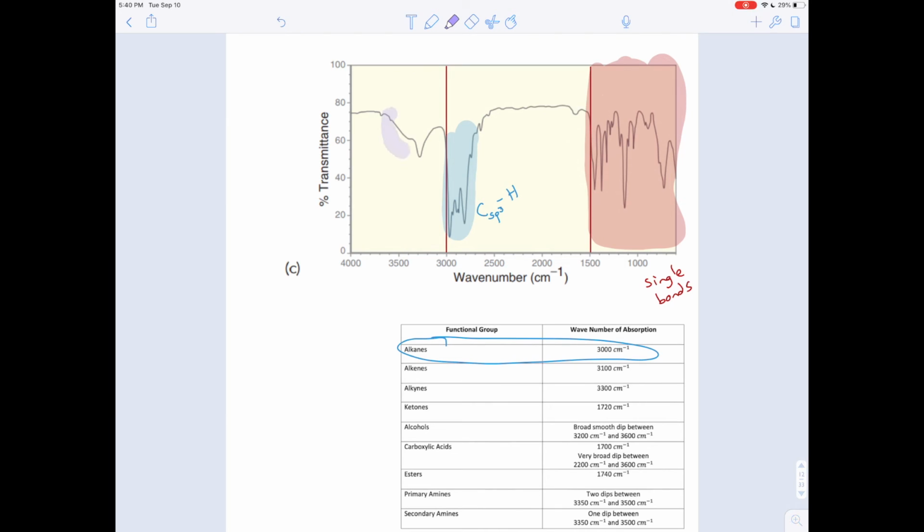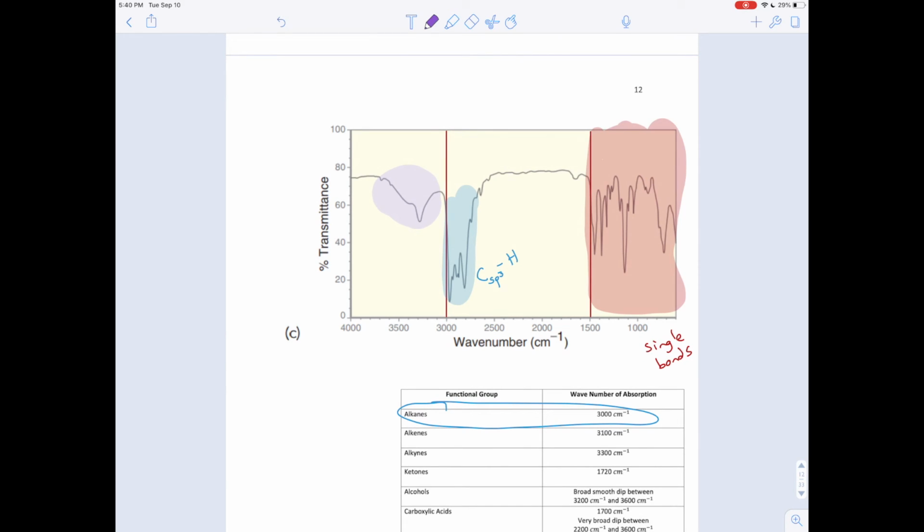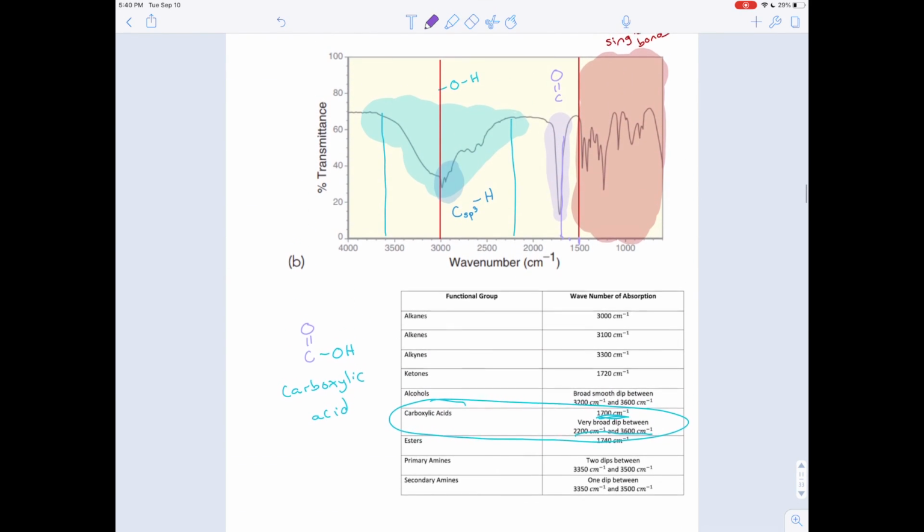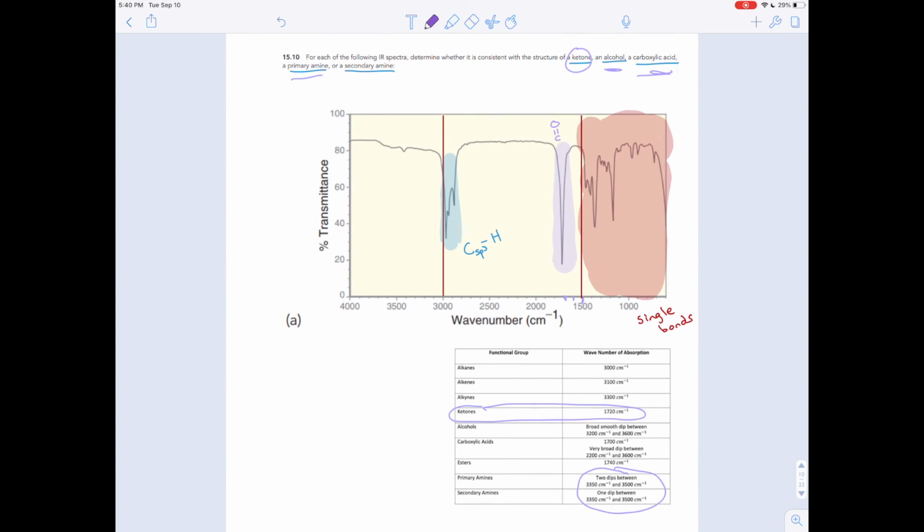And now we have this other kind of, I guess it's big enough to be a dip, right? It's not as small as this little thing over there. Remember that you're always comparing these, even if you look at these different spectra that the book is making. The book is trying to make them look nice because you're learning on these, but the line changes. It's not always at the same place. Here it's around 70, here it's above 80, right?